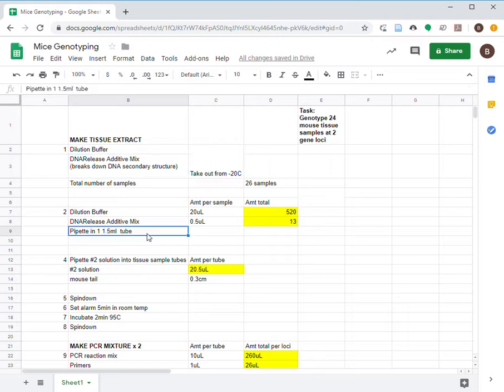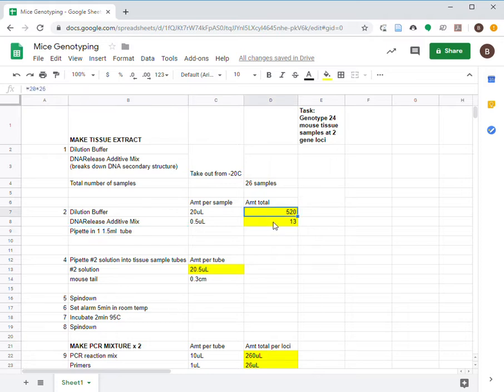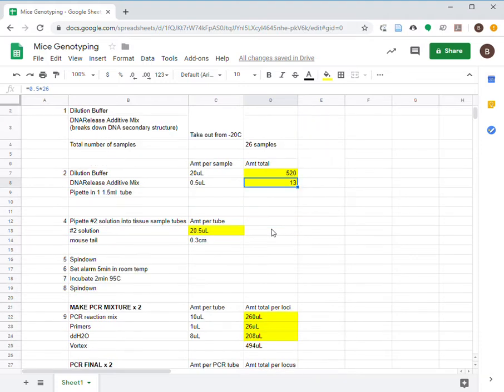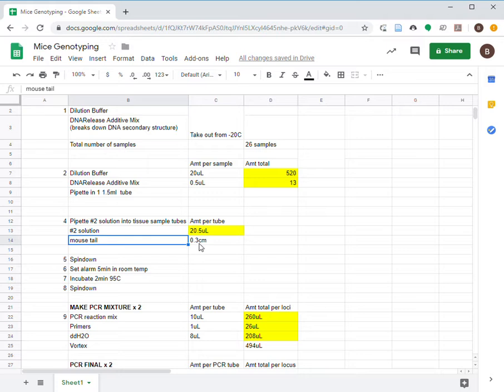add in 520 microliters of dilution buffer and 13 microliters of DNA release additive mix vortex. Then, into each of the mouse tail sample tubes, add in 20.5 microliters of the above solution.